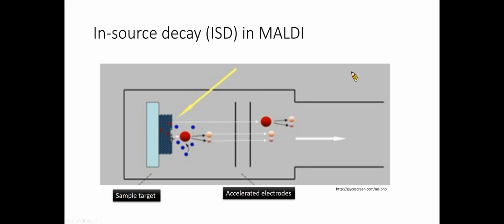In-source decay fragmentation occurs in the ion source via stochastic radical formation. ISD appears to occur through hydrogen radical transfer from matrix ions in the ion cloud. No energy relocation to labile bonds, as in CID, occurs on the sub-nanosecond time scale.